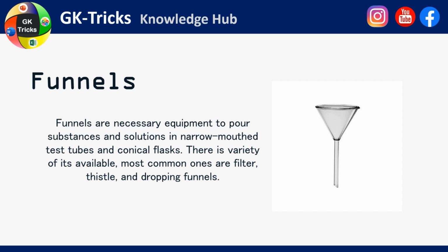Funnels. Funnels are necessary equipment to pour substances and solutions into narrow-mouthed test tubes and conical flasks. There is a variety of them available. Most common ones are filter, thistle, and dropping funnels.